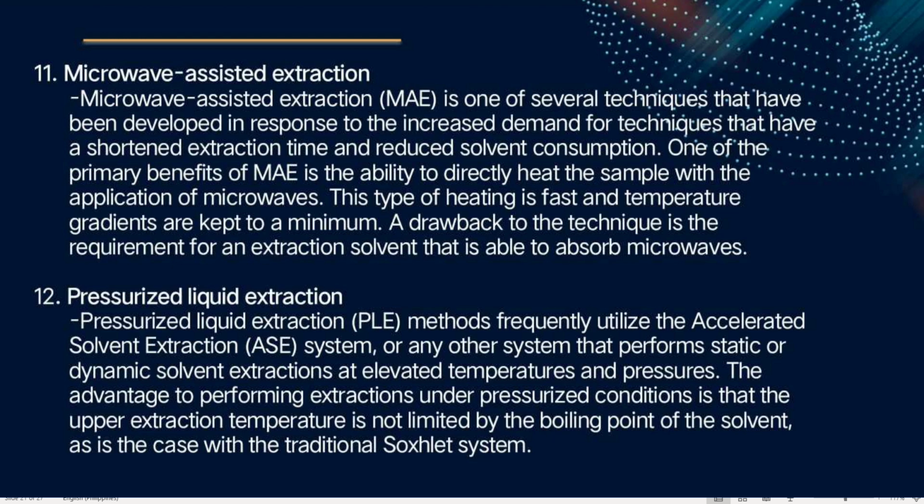Pressurized liquid extraction, also known as accelerated solvent extraction or pressurized fluid extraction, is a method of extracting a sample using conventional solvents under high temperature and pressure.